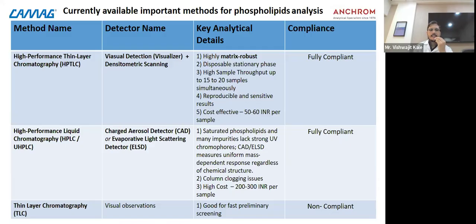And the last, third technique, very commonly used for phospholipid screening of large sample pools, is TLC, thin layer chromatography. It is based only on visual observations and is good for fast preliminary screening, and it comes under non-compliance.